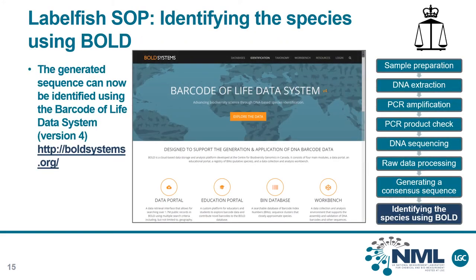The final step of the Labelfish SOP is species identification. This is achieved using the Barcode of Life data system, known as BOLD, a publicly available database containing barcode sequences for many species. BOLD is currently at version 4 and can be accessed at http://boldsystems.org.